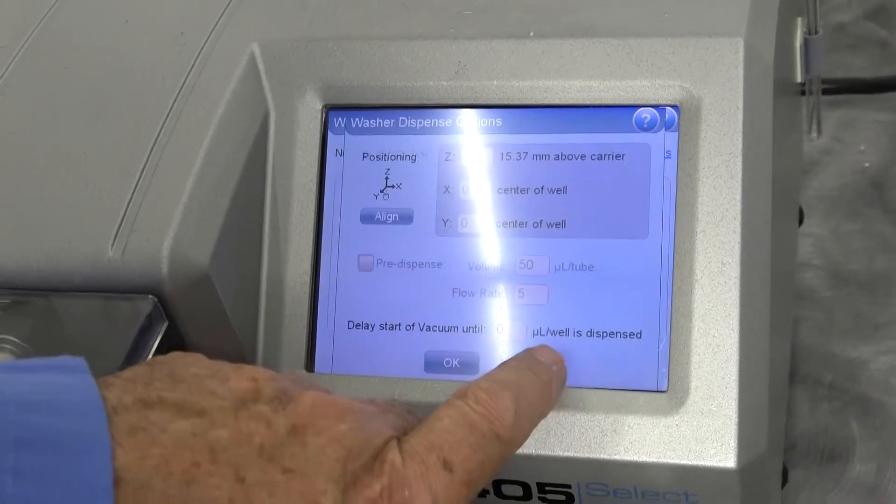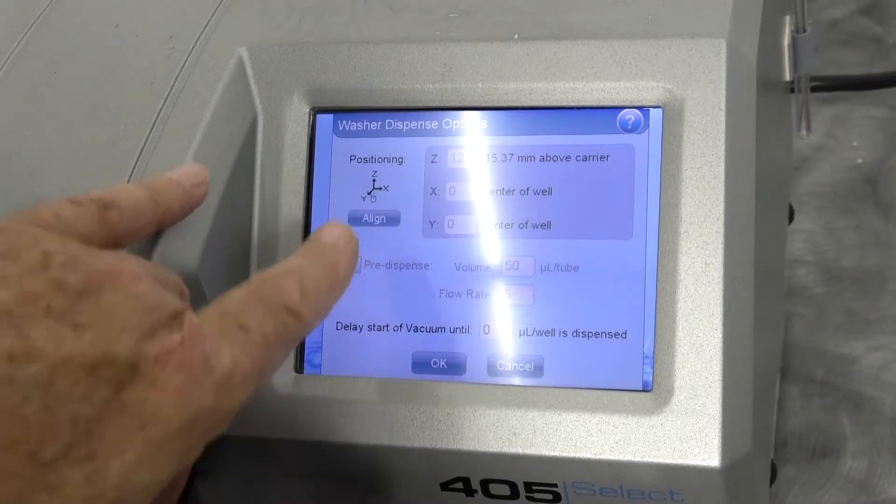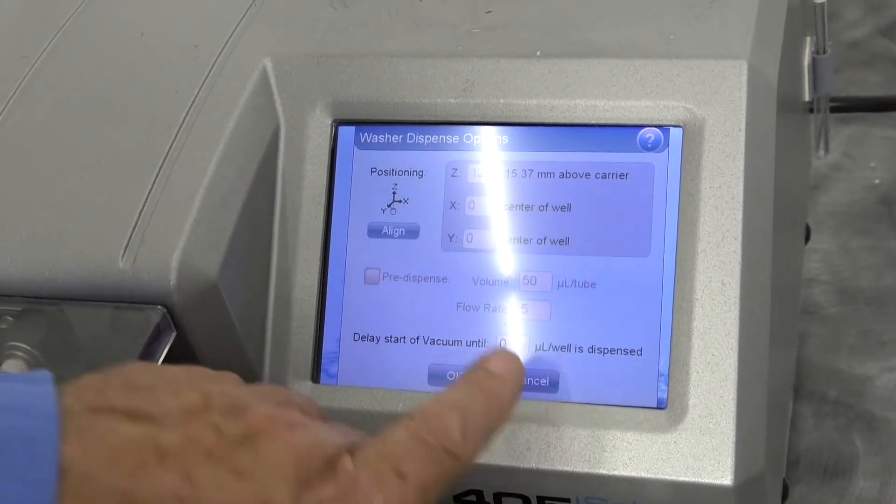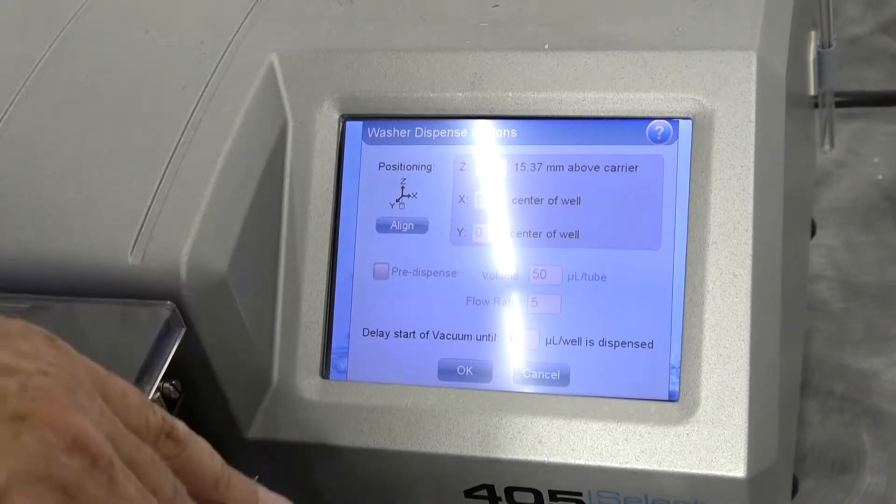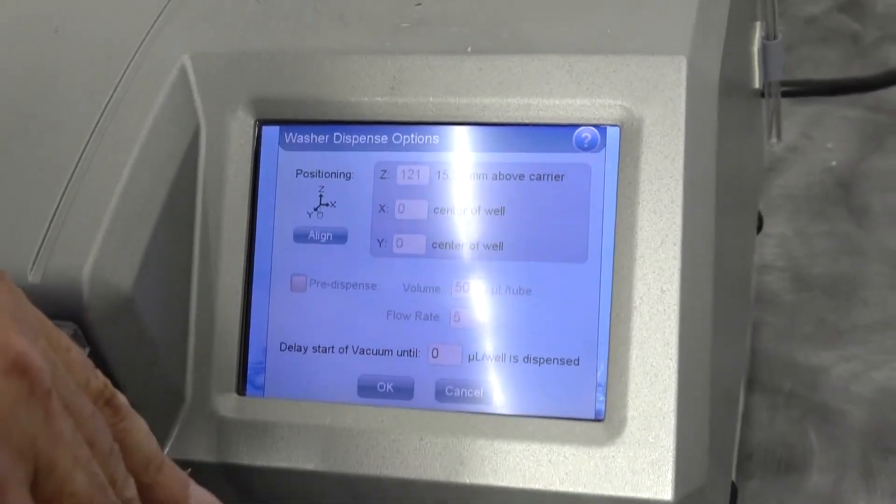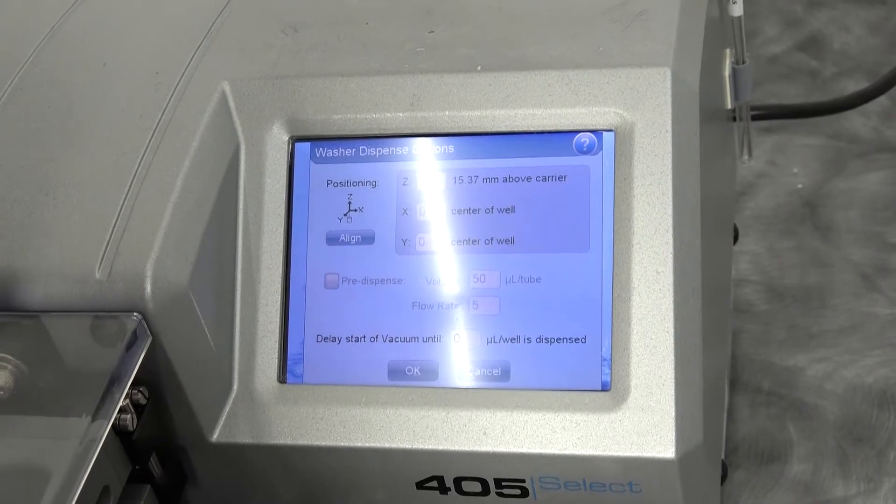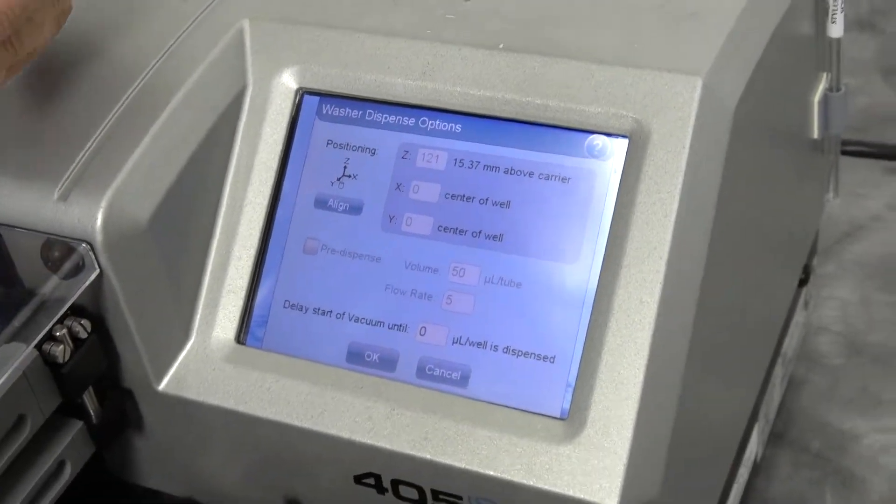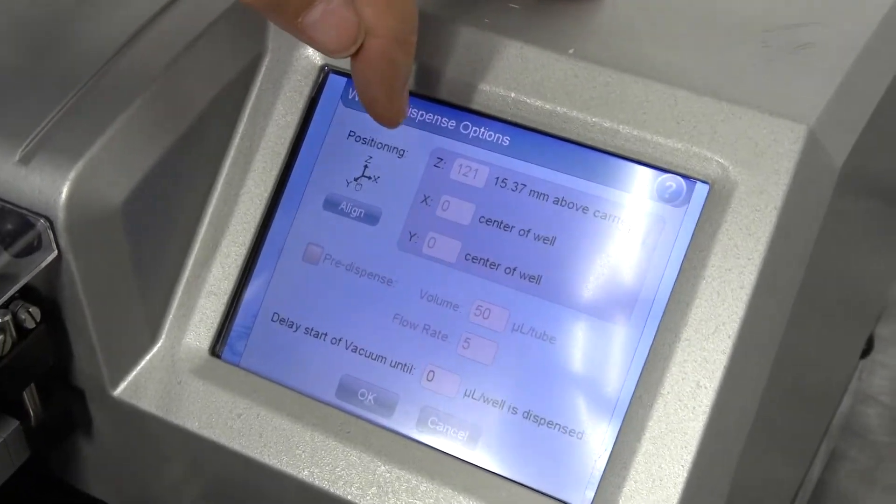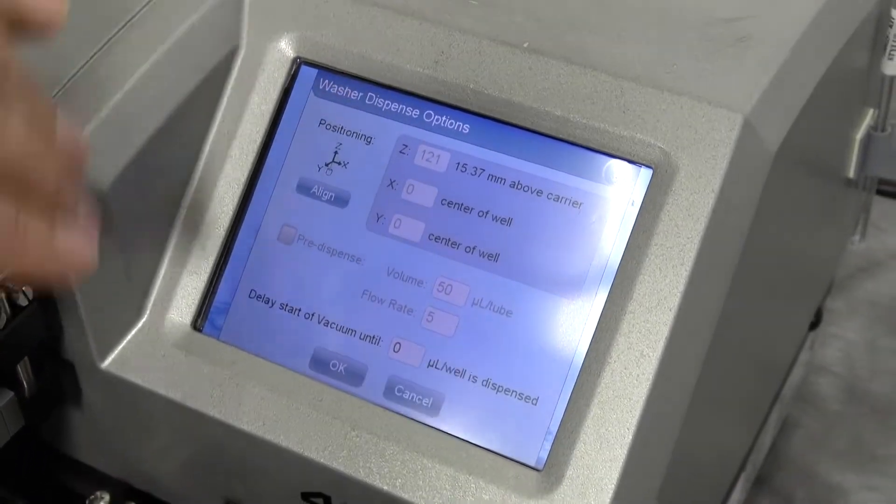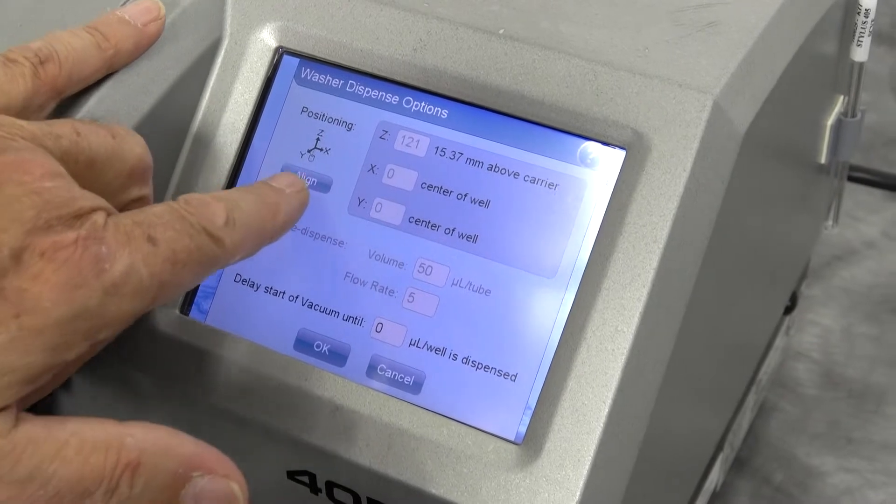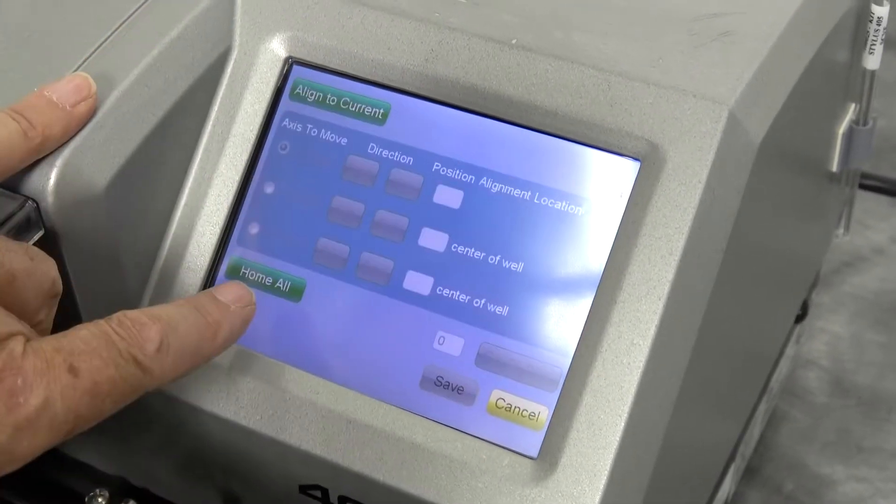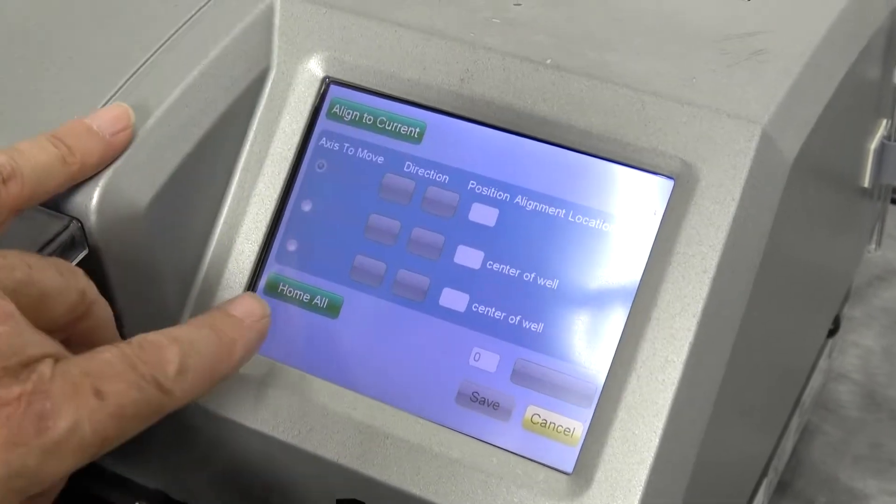It's just remarkable, and then there's still options on top of those options, and you can align. If you have a plate that you like that's not a pre-standard plate, you can set your alignment to meet your needs. You can teach it that for its particular plate just by going into your alignment mode and set up your positions.